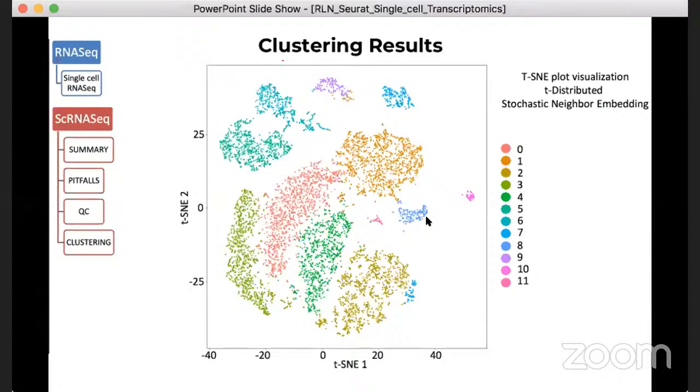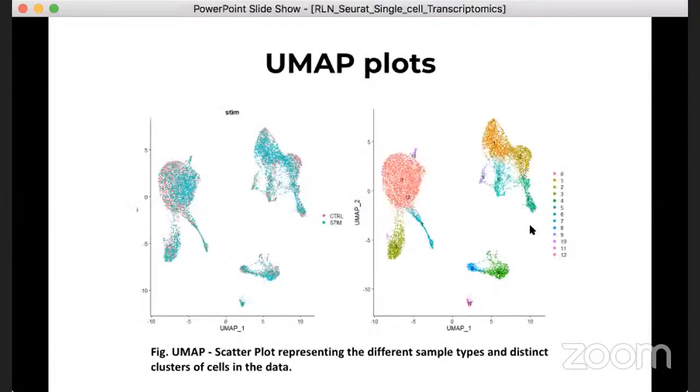In addition to t-SNE, we also got introduced to UMAP and other nonlinear dimensional reduction techniques, which in essence use the top principal components to visualize these patterns. So that is what we will use to speed up this process of identifying these clusters using a nonlinear technique.